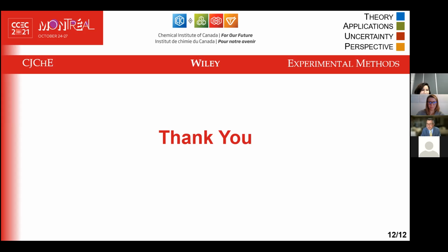All right. Thank you. Any questions from the audience? I do have a question. Yes. So Nooshin, you're talking about all these electrodes, and when we talk about measuring acidity, normally we are in aqueous diluted solutions. So what if we are in concentrated solution, like for example, ionic liquids, and I want to determine the acidity? Would I be able to use the same electrodes?